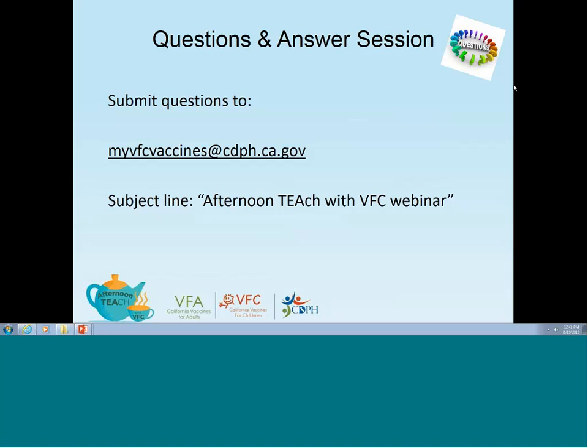We do know that they are much more accurate than the previously used min-max thermometers. If you are having a lot of excursions, I would go back and double check and take a look at the slide that we provided, what you could do if you're having alarms. I don't know if you've been able to try those troubleshooting steps.